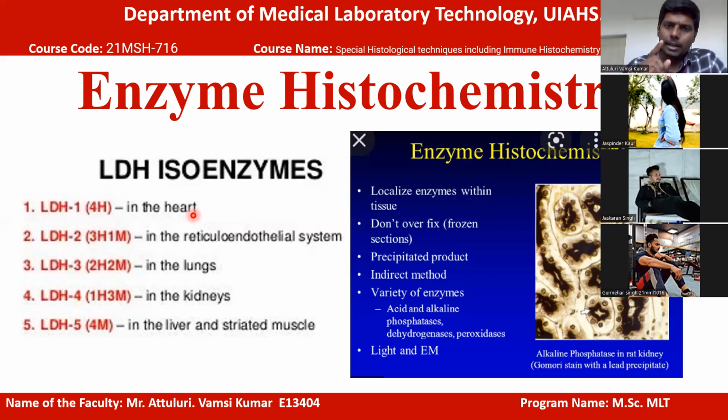So now we are trying to locate the enzymes within the tissue in enzyme histochemistry. This has many clinical applications. The basic idea is to visualize the enzymes within the tissue, and how we are going to visualize enzymes within the tissue is the idea of our enzyme histochemistry.